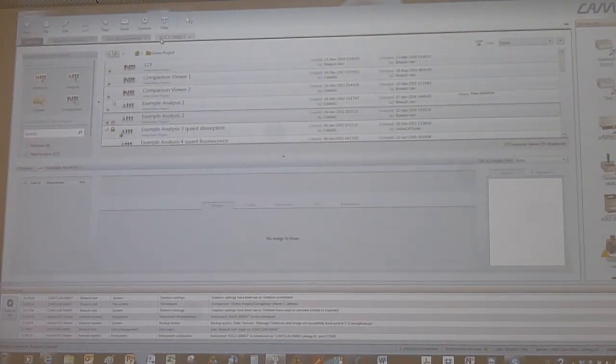You can say, okay, I just want the entries with profiles. Then just the one you have seen now, there were fewer entries because it's just about file creation. So there are really a lot of things to search. And if you remember WinCATS, it was just a huge list, and there, if you wanted to search something, you really had to go and search.